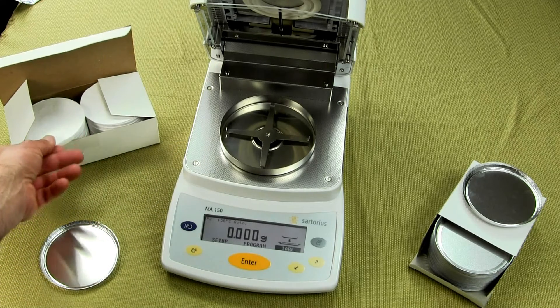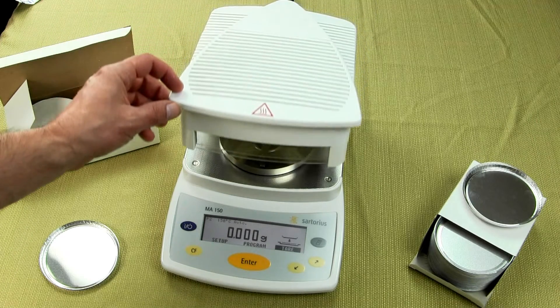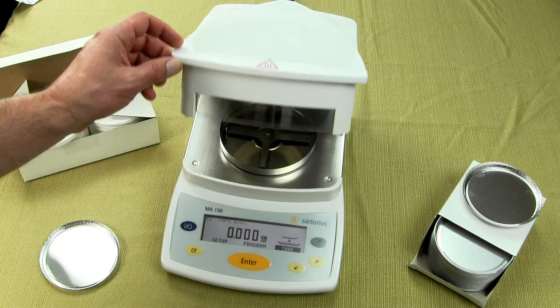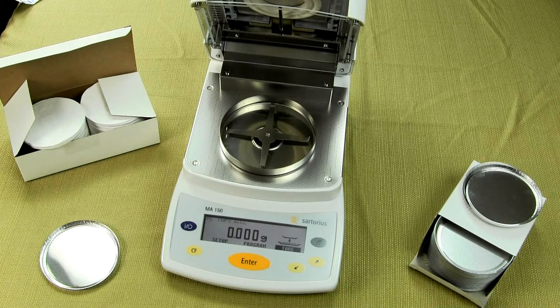These filter pads come 200 to a box, or you can buy 4,000 at a time. On the MA-150, this balance is built in Germany and uses a ceramic heating element. Many moisture balances on the market today use halogen. One reason they use halogen is because it's cheap to manufacture, and the halogen bulb is going to burn out a lot quicker. So they design those moisture balances to need service. Sartorius gives you the ceramic element with the MA-150.